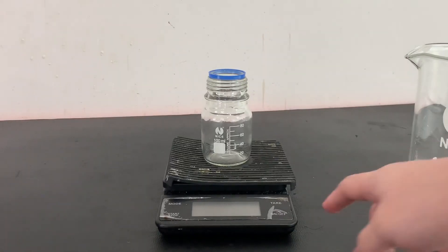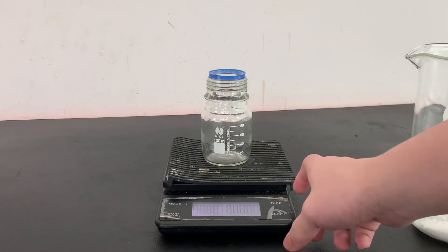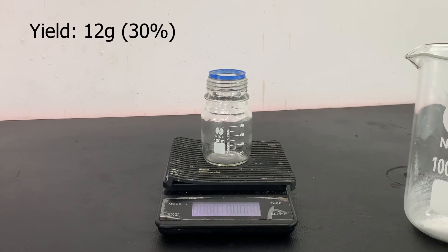The wet 3-nitrophthalic acid was then dried in the oven for a few hours and the yield was measured. The yield came to be low at around 12 grams of product. A low yield like this should be expected as this reaction mainly produces 4-nitrophthalic acid.